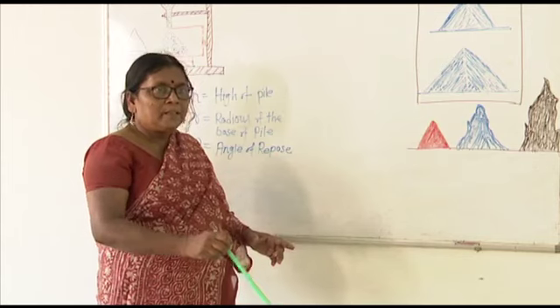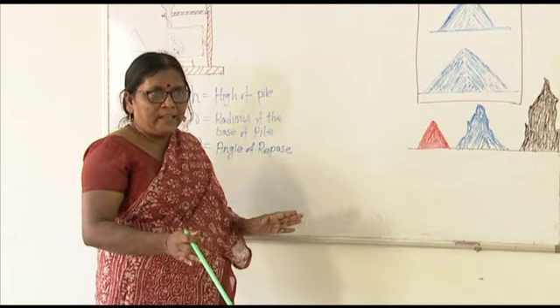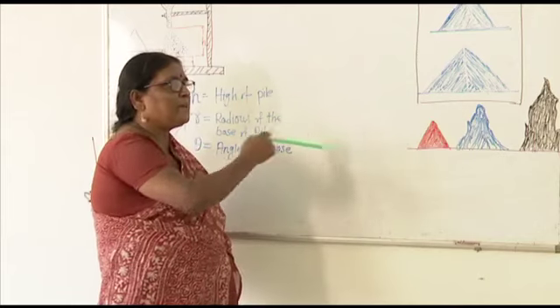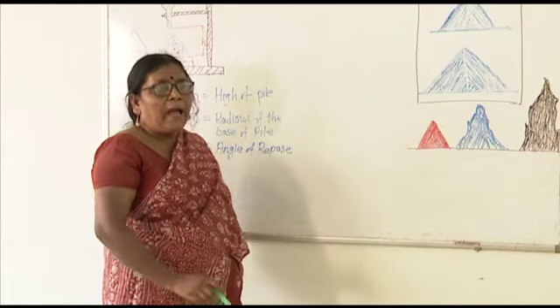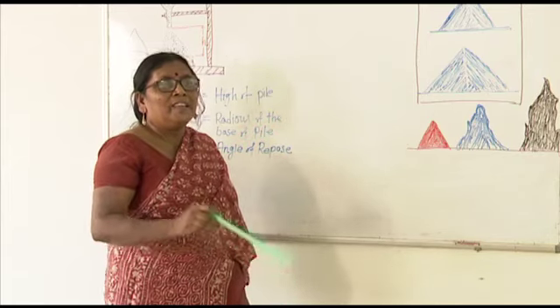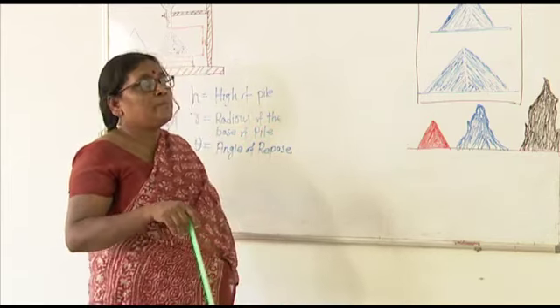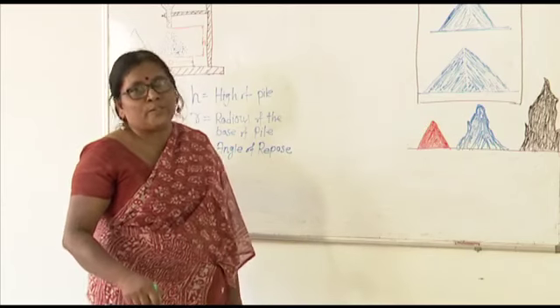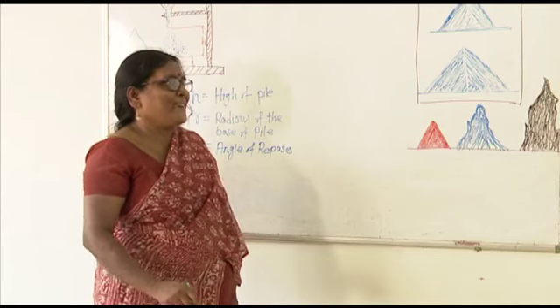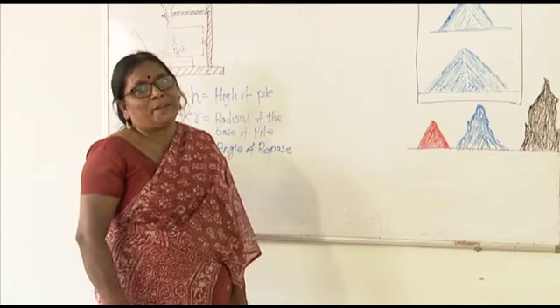So these particles are taken, their angle of repose is measured, the database is available, and just by looking at the angle, we know whether this particle is going to create problems during the actual processing. Now, I hope you understand the importance of this experiment.